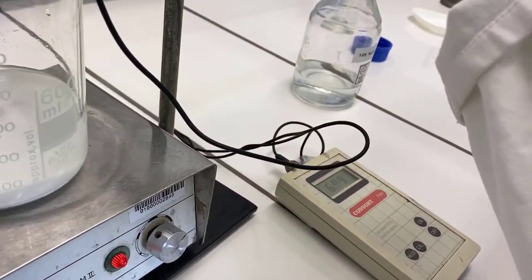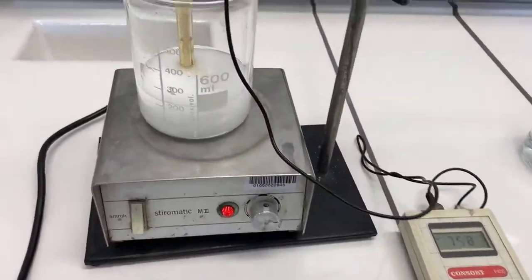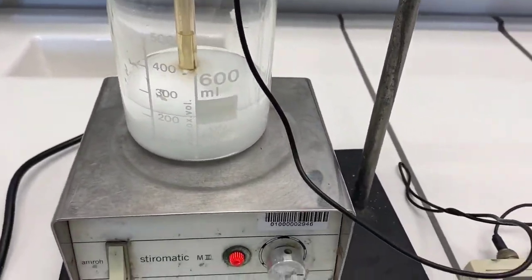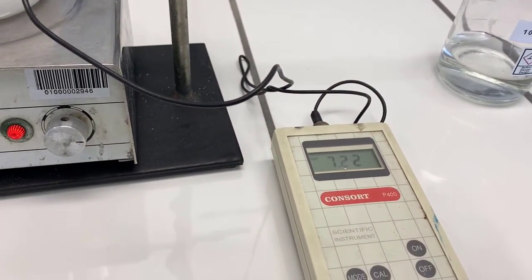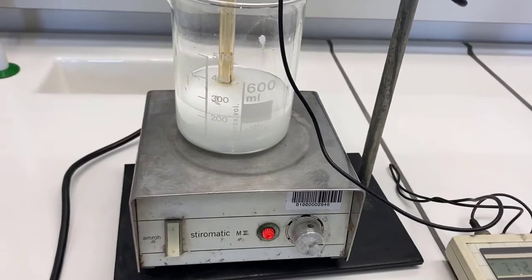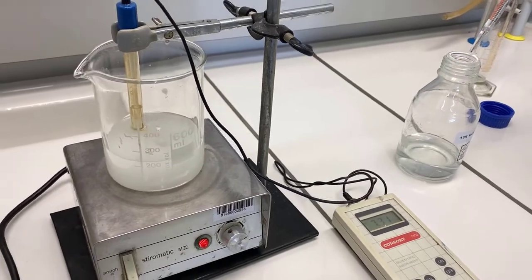You will see that the pH will increase immediately. EDTA will start dissolving in water from around pH 7, and as it starts dissolving, the pH of the solution will drop again, but it will get stabilized at a certain point. When the pH does not drop further, add more sodium hydroxide.